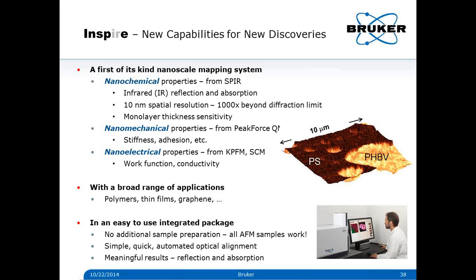I see a question coming in here, whether the instrument would be suitable for very soft materials, lipids or proteins. I should say the measurements we've shown here were done in air, not in liquid. The instrument, I would say, is suitable in that the technique itself operates intrinsically in tapping mode, and we've also shown that we can operate it in PeakForce Tapping, using that for feedback. So we're well set up for very soft samples where you might have to use tapping, or where you would only be able to use PeakForce Tapping and where you couldn't use contact mode.